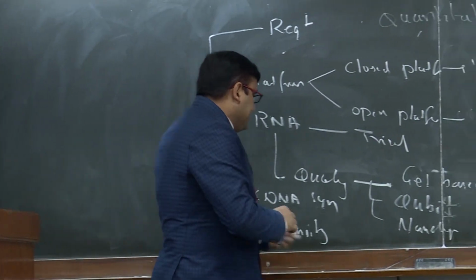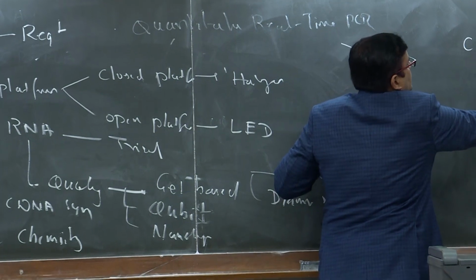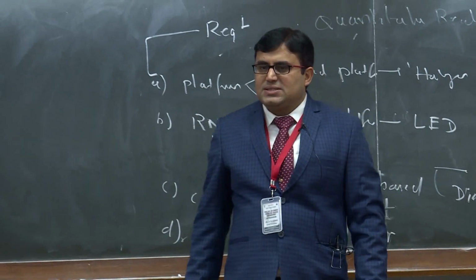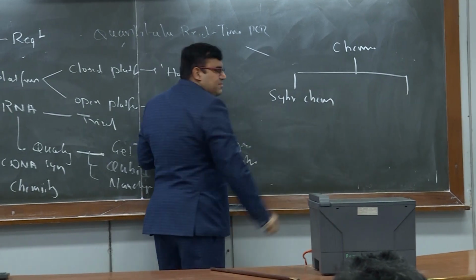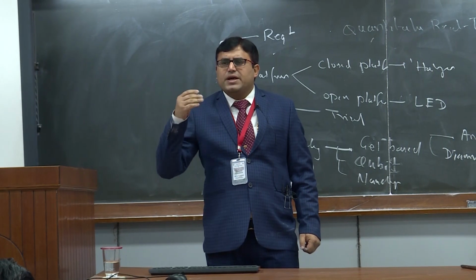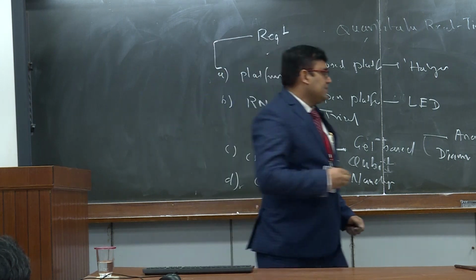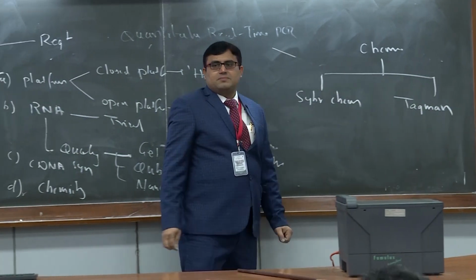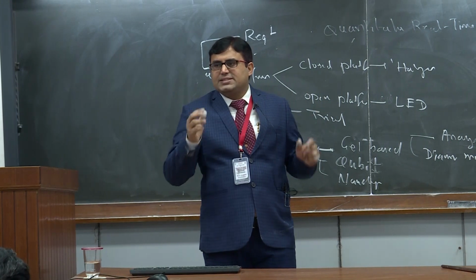Is it okay? So once you have synthesized cDNA, next is the chemistry which you are going to prefer. In case of real-time PCR, two very popular chemistries are there. One is SYBR-based expression analysis. SYBR is basically a cyanine-based dye. It is a water-soluble dye. So SYBR-based chemistry is very commonly used for the expression analysis of a gene. The other is TaqMan-based chemistry.